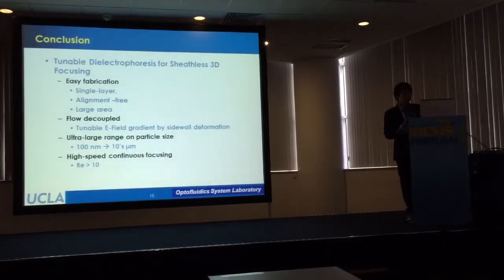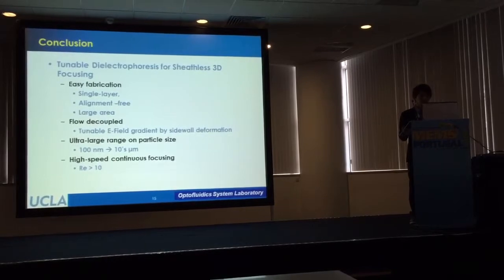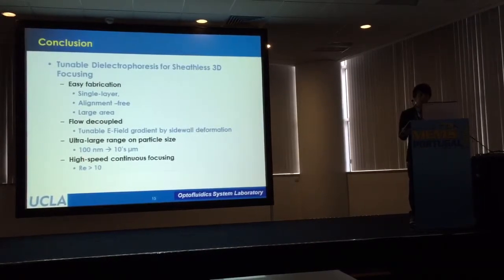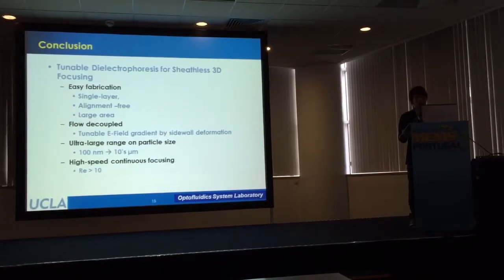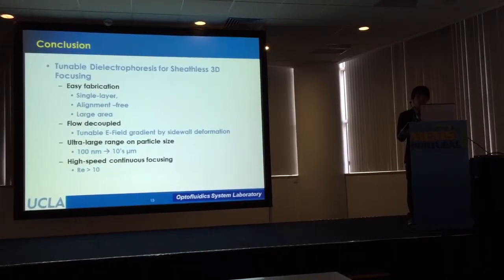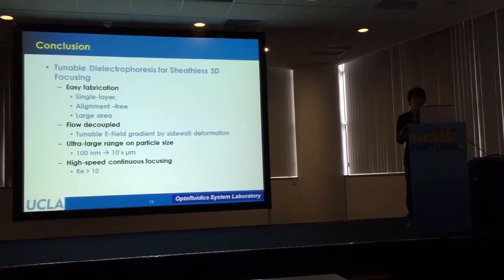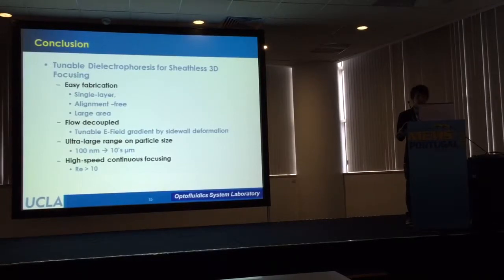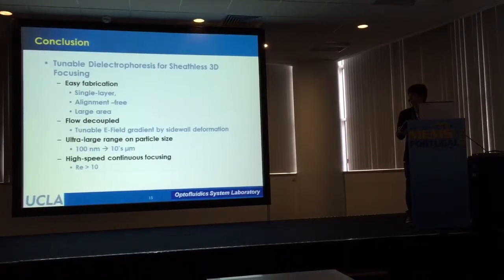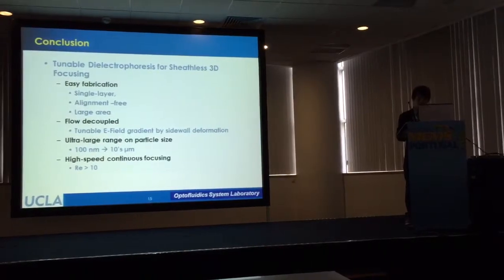To conclude this talk, this platform successfully demonstrates tunable 3D focusing in high-speed flow. This is a single-layer, large-area open PDMS thin film sandwiched between two patternless conductive substrates. The flow decoupling concept is realized by the beauty of self-aligned tunable sidewall deformation along the entire channel. Particle sizes ranging from 100 nanometers all the way up to tens of micrometers in high-speed flow over a Reynolds number of 10 have been demonstrated.